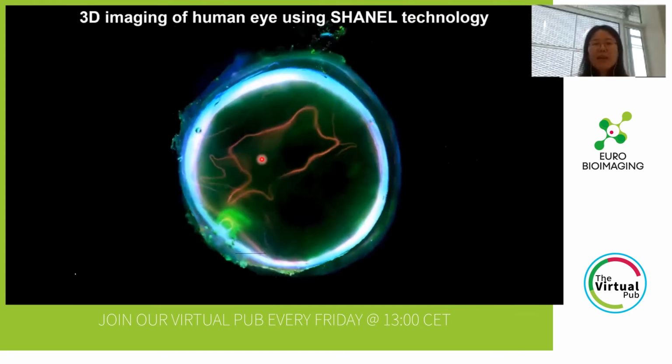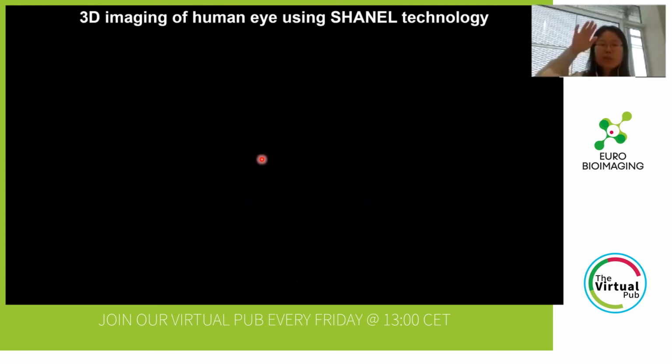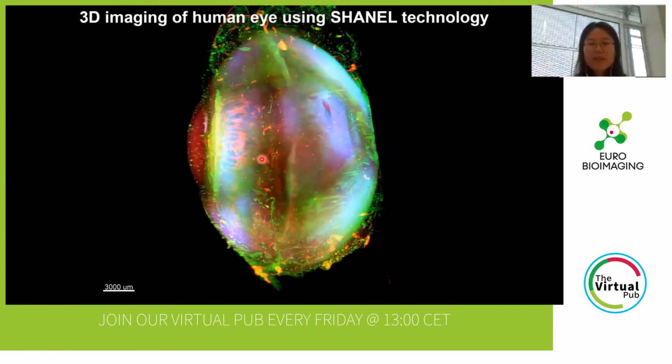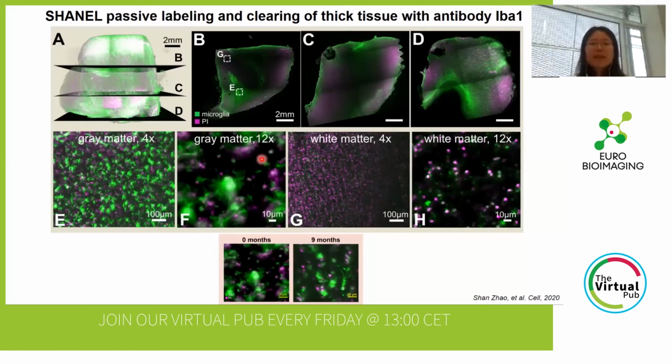Here shows how we imaged the whole eye from top to bottom across the Z direction, to show the transparency and also the imaging of the details. Not only with the organs, we also want to see, with this protocol, if the antibody can really penetrate inside and we can image it. So here I show an example, IBA1 labeled microglia cells in a human brain cortex part. This sample is around 1.5 centimeters in thickness.